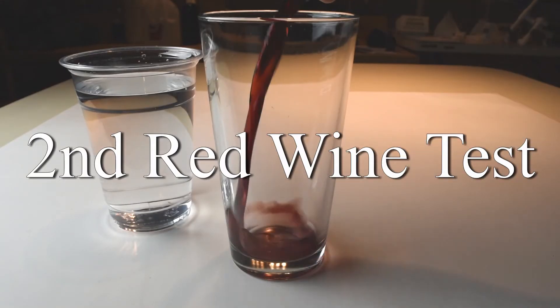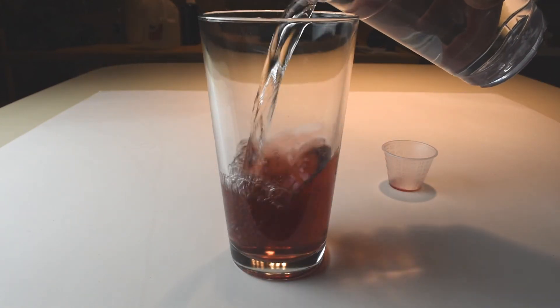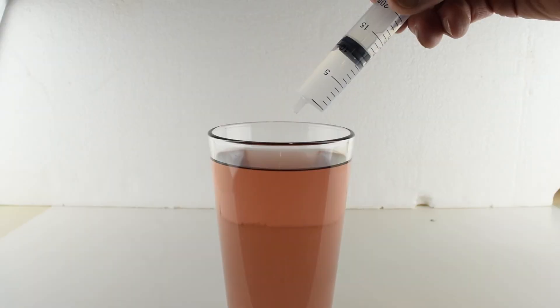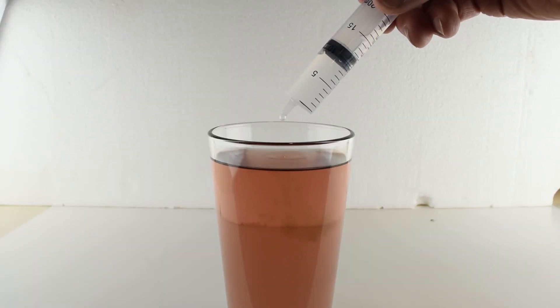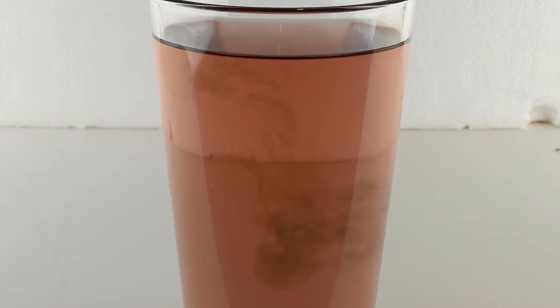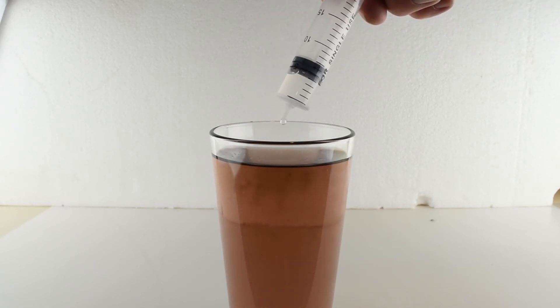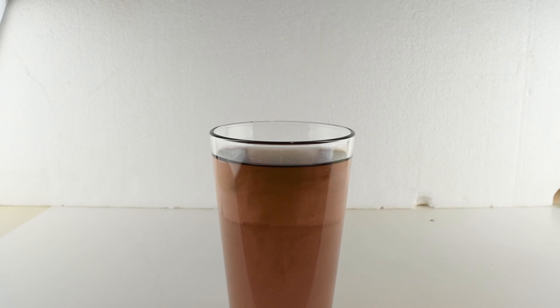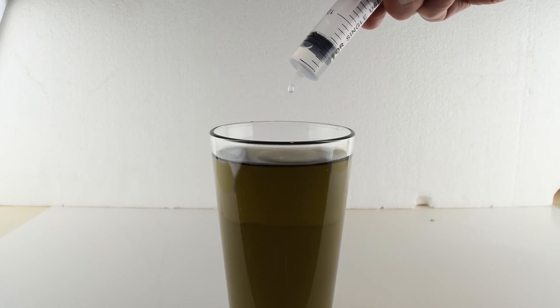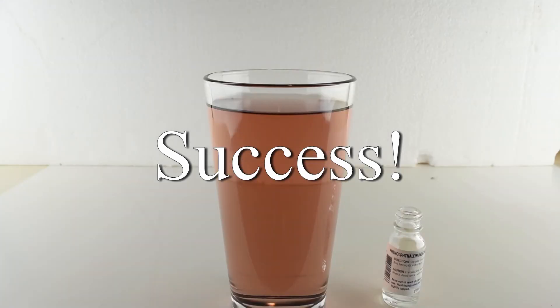For the second test I added more distilled water — 300 milliliters — then added the three drops of phenolphthalein. As soon as I added sodium hydroxide to the sample, I began to see ribbons of color, something I never saw in the white wine. I slowly added and mixed until the color stabilized after adding six and a half milliliters of solution. Here's a before and after.